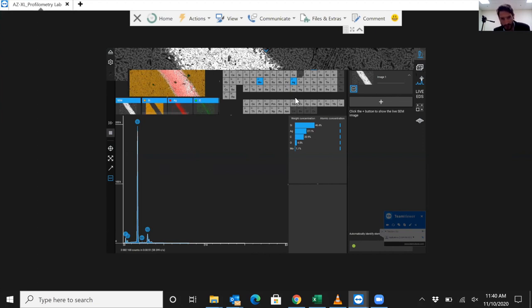That's the final thing I want to show you on here, and then I'm going to turn it over to Bob for Q&A. I want to very briefly show you our nav cam, so you can see the lag, definitely a little laggy. This is waiting for this to minimize, but once this minimizes, you should see here in a second what it looks like for our optical view.